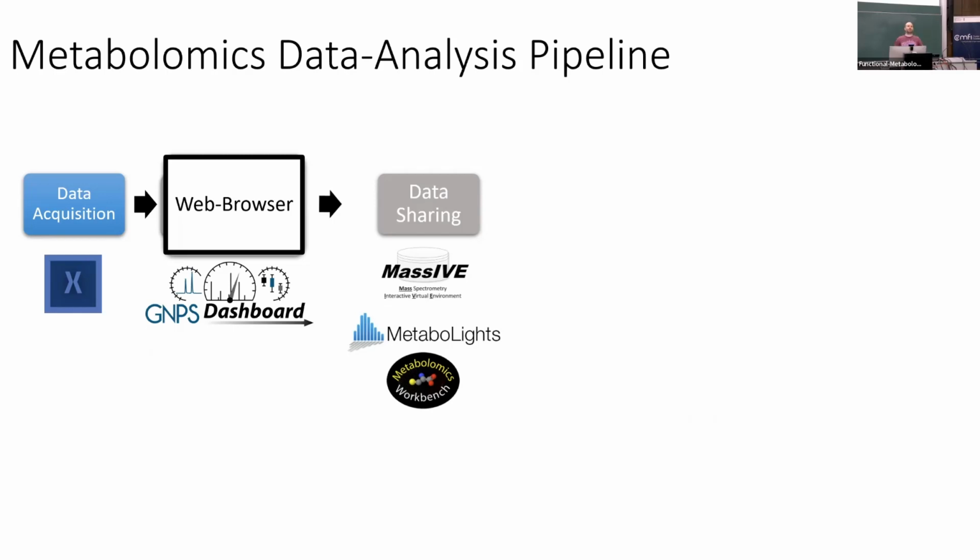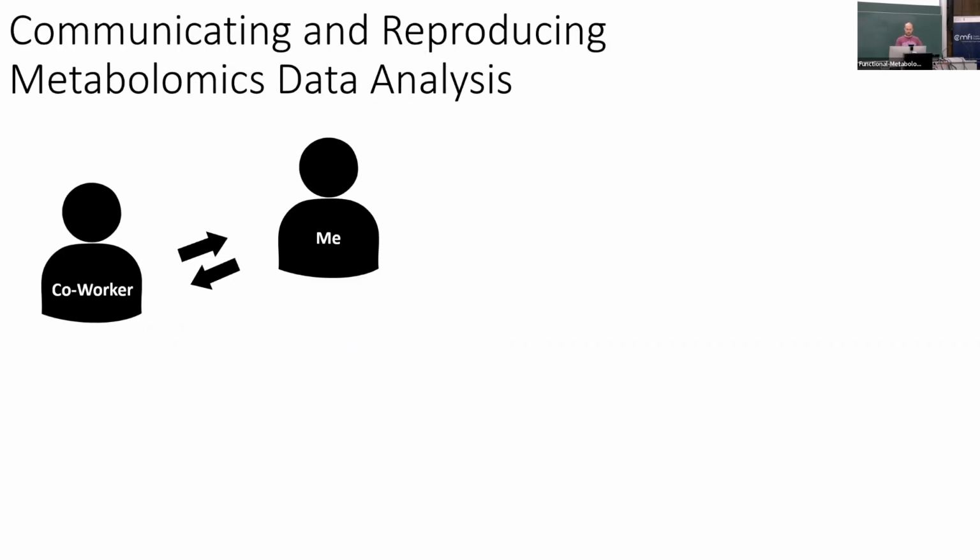So now, we showed you the full thing, feature-based molecular networking, which is probably the most sophisticated way of analyzing non-targeted LC-MS data. But it also comes with the risk of setting things wrong, and then things can go very downhill quickly. So classic molecular networking out of the dashboard might also be a better start.